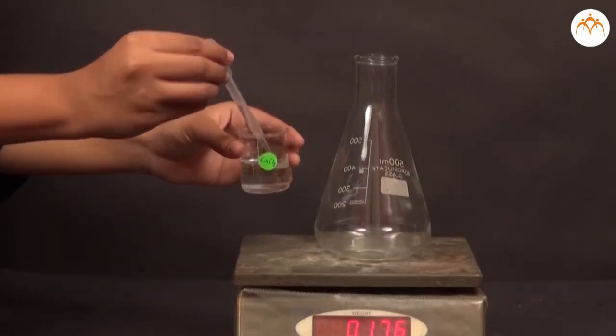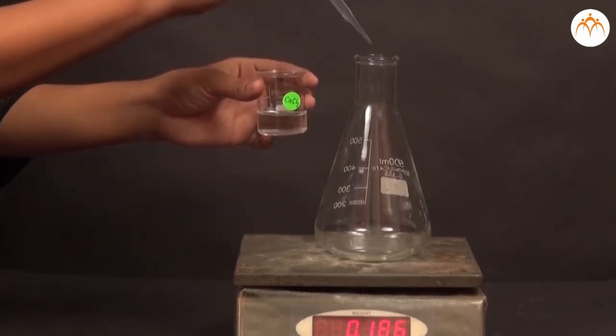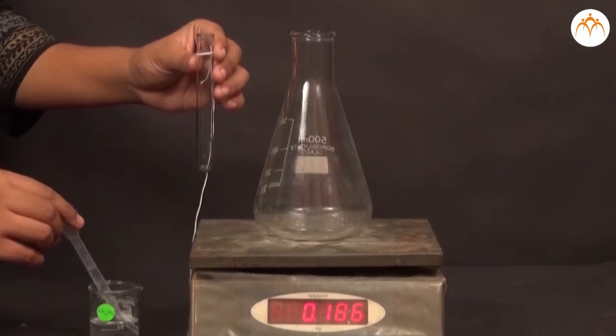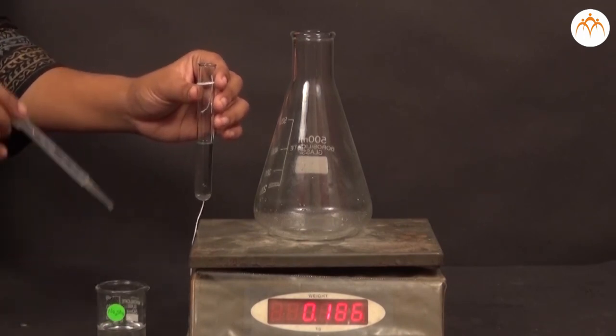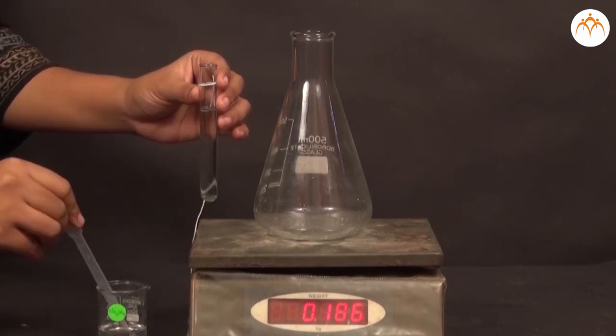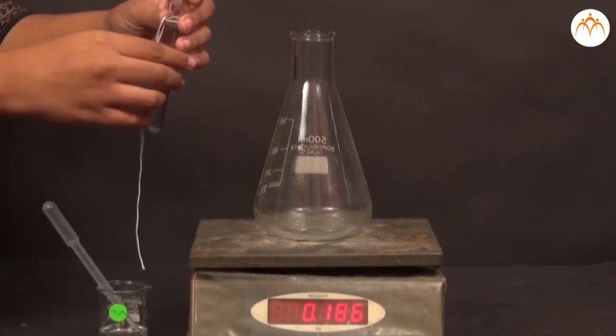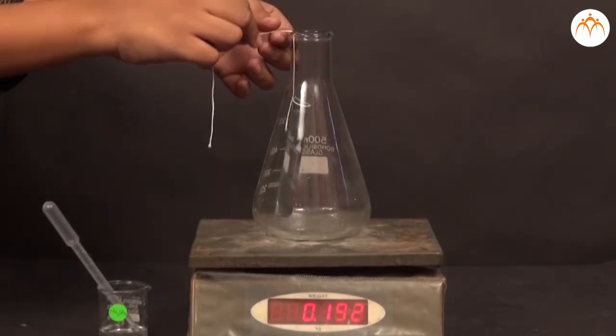We will first take solution of calcium chloride in a conical flask, then take sodium sulphate in a test tube. We will tie a thread to the test tube and release it in the conical flask, then fix a rubber cork on the conical flask.